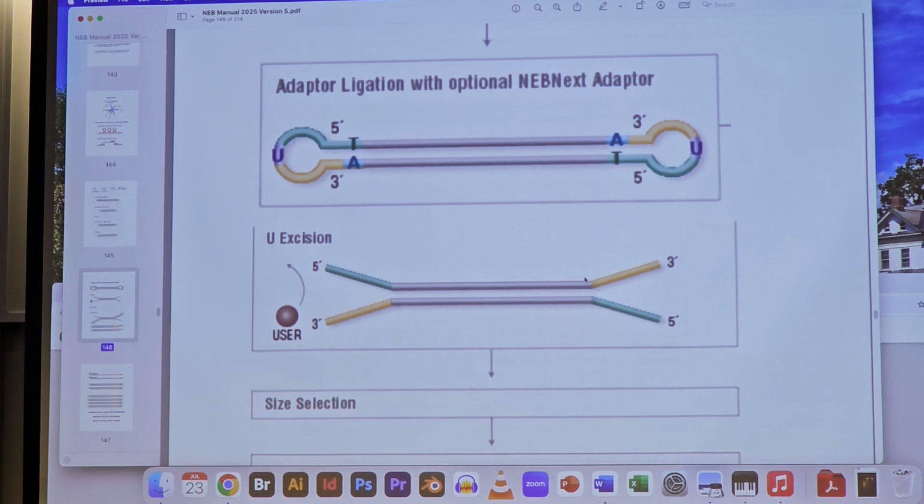If we were going to do it by just ligating the green one and the yellow one on, it would be complicated because we'd have to run those reactions separately, and it would be more complicated than trying to do it the way with 2 ligations. So by 2, I mean 2 separate ligation runs. You want to think about it that way. So here we put in one thing, and we do one ligation and one tube. If we were going to add these separately, we'd have to do 2 separate ligations.